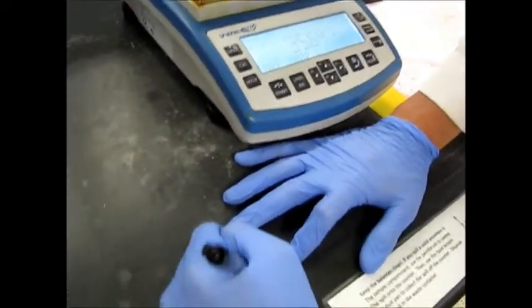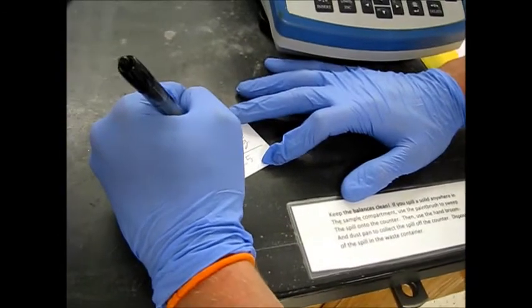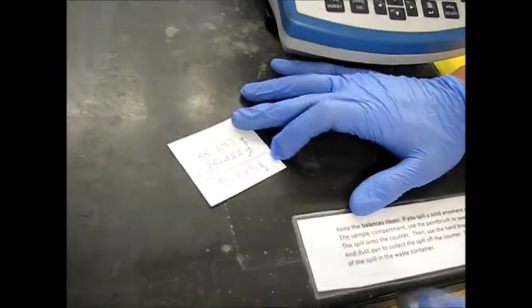So we'll get 225 milligrams. So just over 225 milligrams.